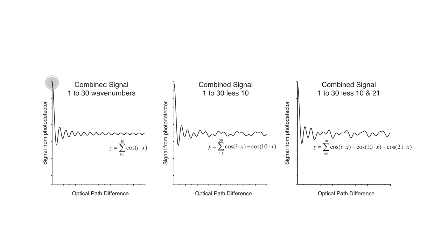And that value right there, that represents the original amount of infrared radiation that your spectrometer can receive. That's it. That's how much IR it's receiving. If that is low, your spectrometer is going to know not much light is getting through your sample. It might even say, hey, buddy, make a better sample. I can't see anything. Or it might say, hey, buddy, my lamp is burned out. Get another one. Write a check. So you can measure actually how much energy is getting through your sample by really just the original peak.